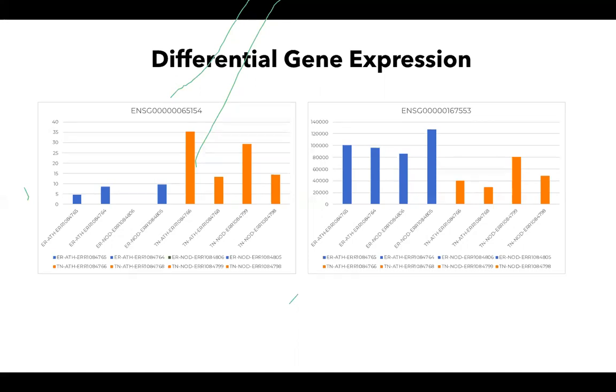Here in this example, we have two different organisms. So we have two different mice models, which we will discuss in this session in much more detail, so that you develop the understanding of what we are actually trying to learn here. So we need to learn about these types of relationships, and we can learn about them when we think about the experiment.